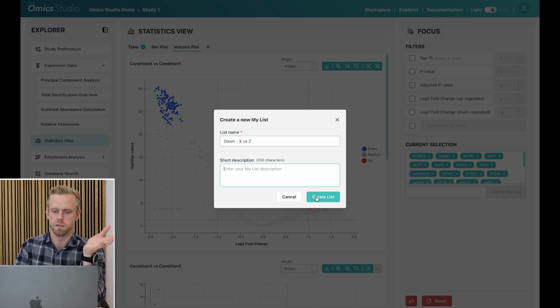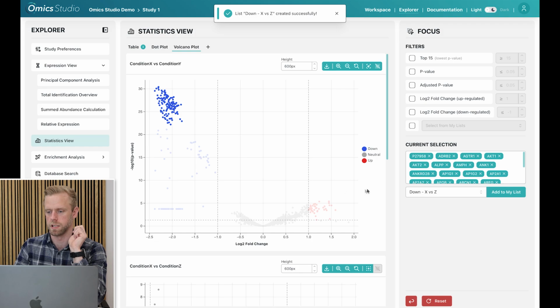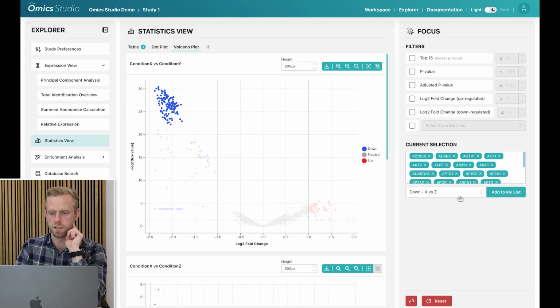I'll not go into that. The name says it all. And then we're creating it. And now we can see we can select it and we can add to it. So now these IDs have successfully been added to this list.